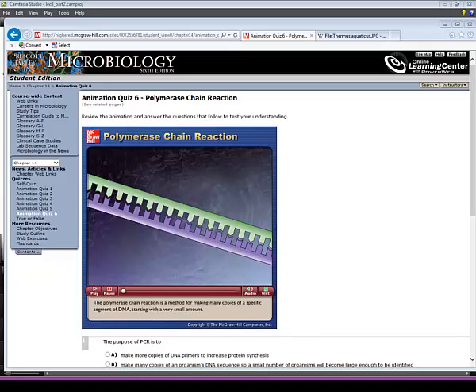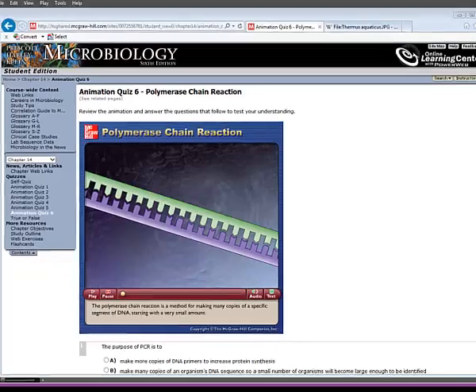So we're going to look at another animation here, which I hope will clarify your understanding and goes into quite a bit of detail about the PCR process.